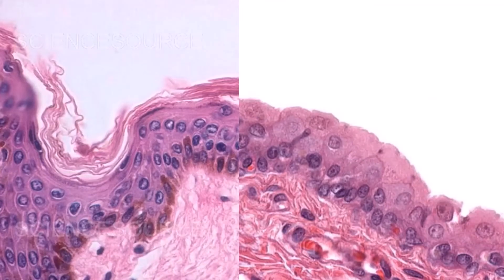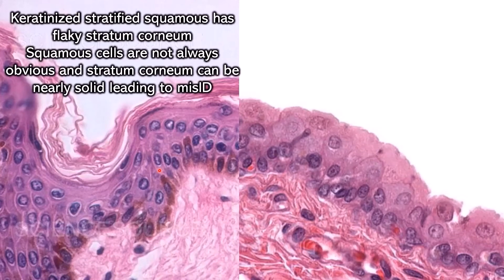You also might mistake this for being transitional, but this is actually stratified squamous. It is the keratinized variety, so it has a flaky top, which is how you know it can't be transitional. However, sometimes the flaky top can be really compressed, so it might not look that flaky, so you have to pay close attention.